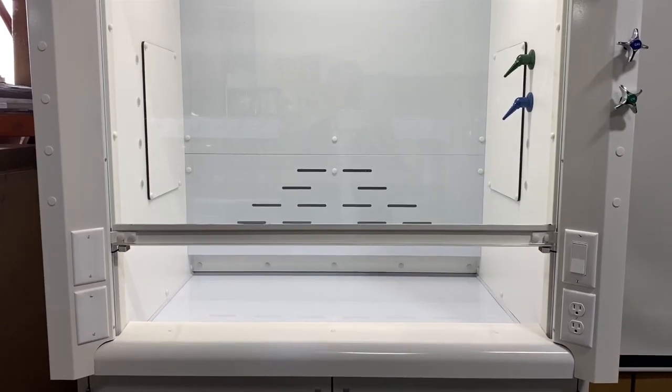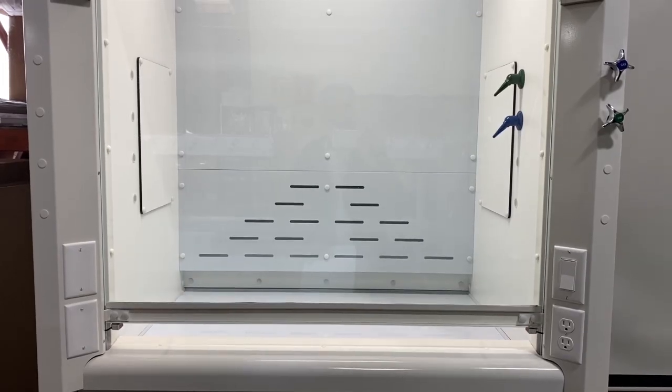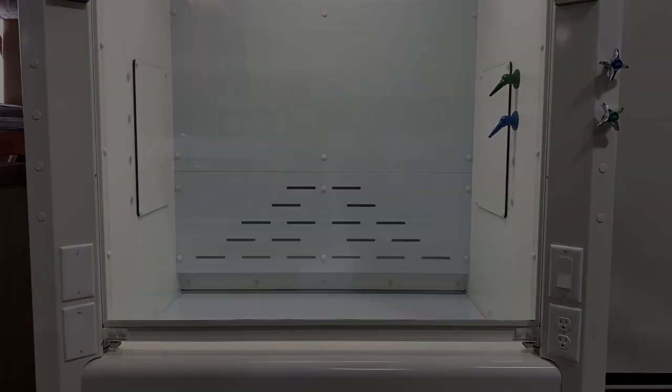Vertical sliding sash with chain and sprocket mechanism operates manually or automatically with optional auto sash controller.